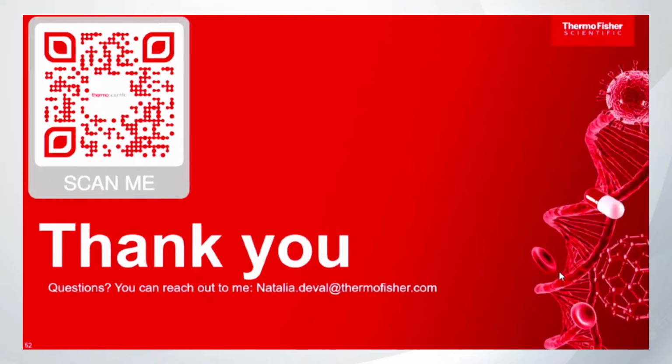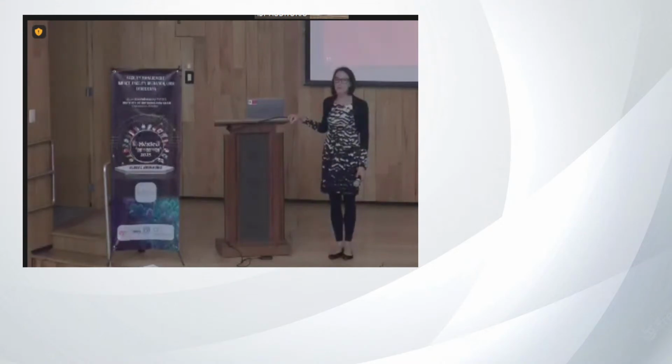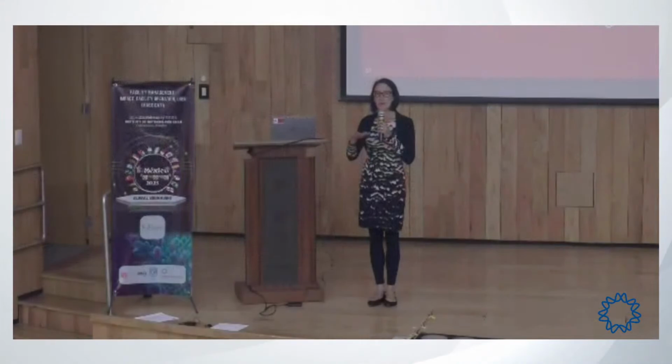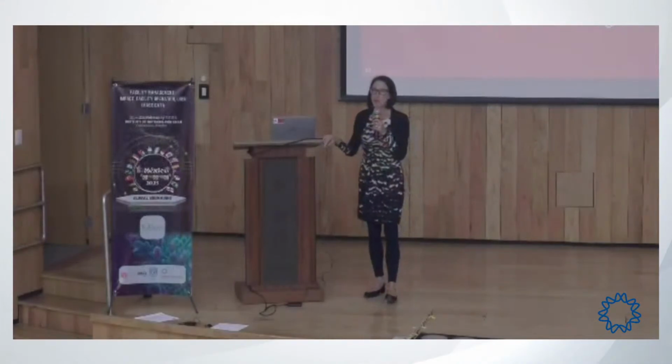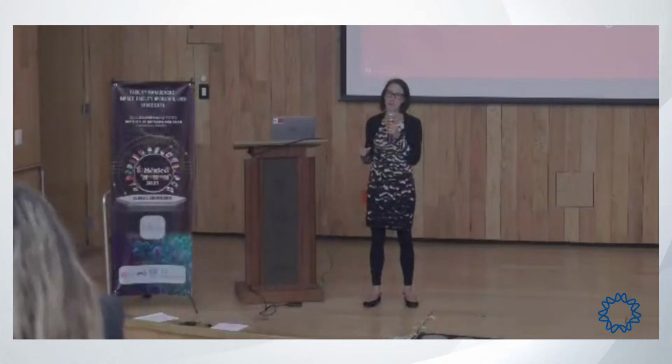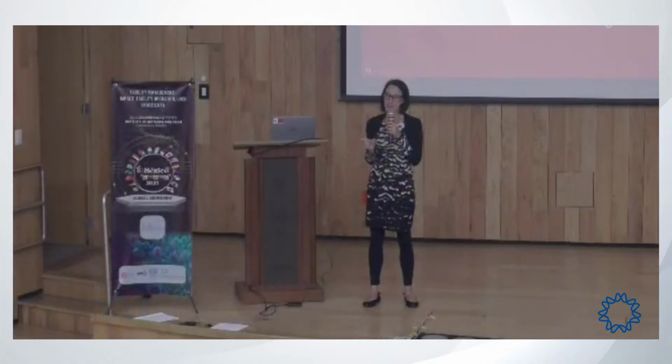I actually have two questions for you, Natalia. First one: is it a destructive technique, or can you re-image over and over again? Single particle, usually no, you have radiation damage in your sample. So usually you take only one image in that specific hole, and that's it. You cannot reuse that grid over and over again.